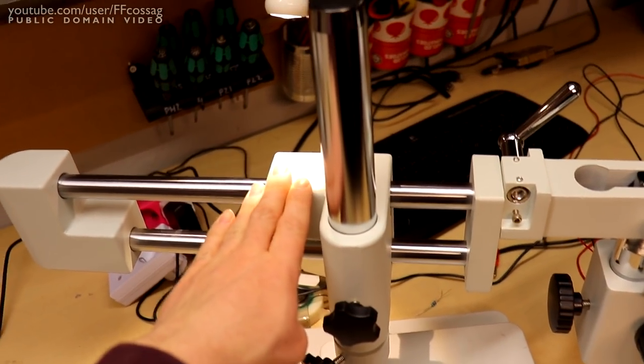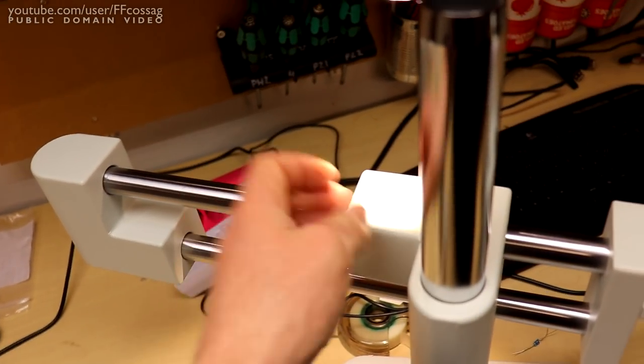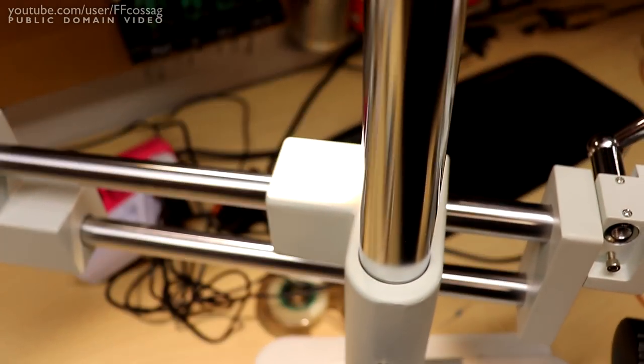So yeah, while they now do provide good quality hardened steel arms, the bearings in here are so bad that they still damage them.